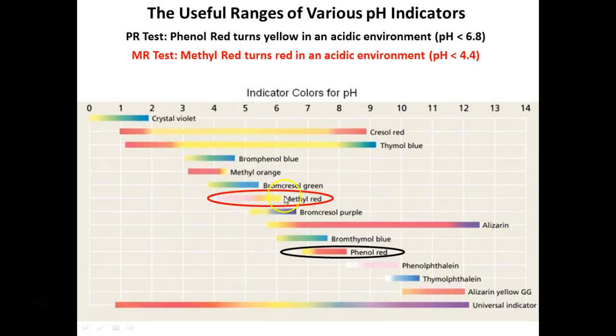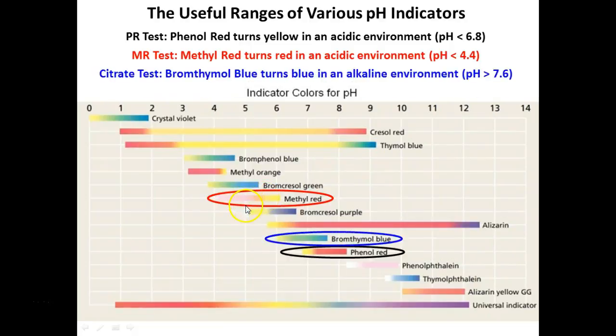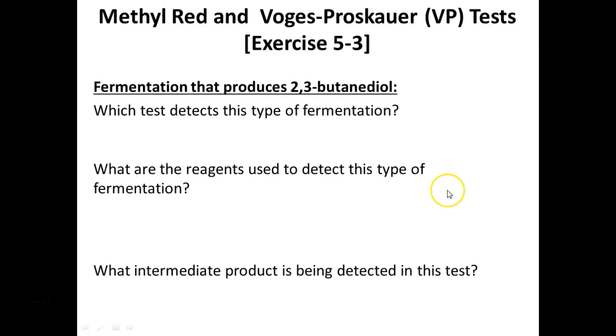So again, there's our methyl red, right? Oh, there it is, bromothymol blue, this one. I was like, that one can't be the right one, because I know that this one's around 7, it's green, but then when it gets above that, it turns blue. And when it's acidic, it's yellow. I played with that one with the kids today, or it could have been this one. I don't know. I have to look. Why do they have to have such similar names to do the same thing?